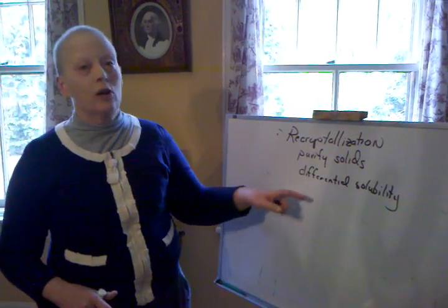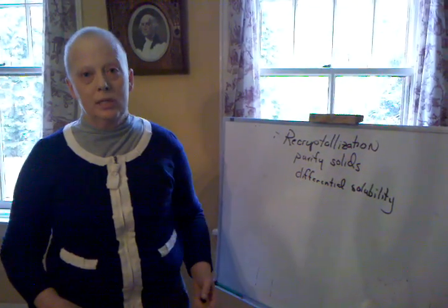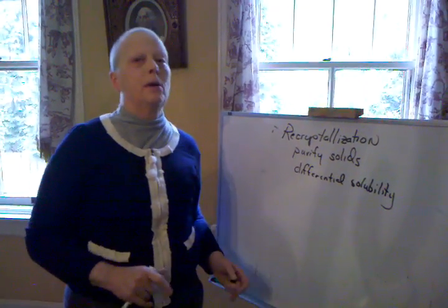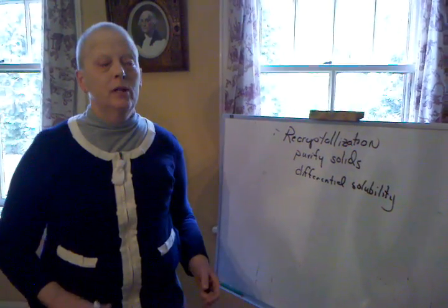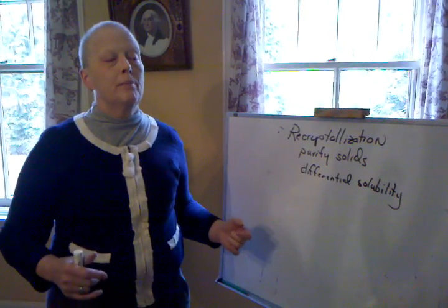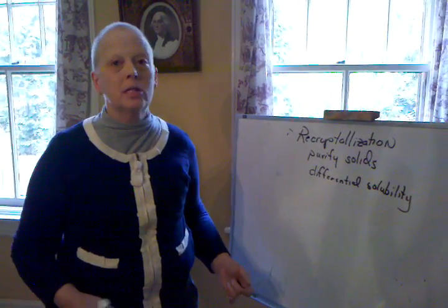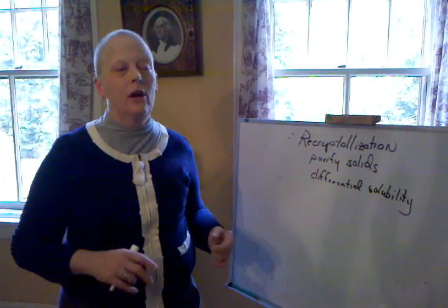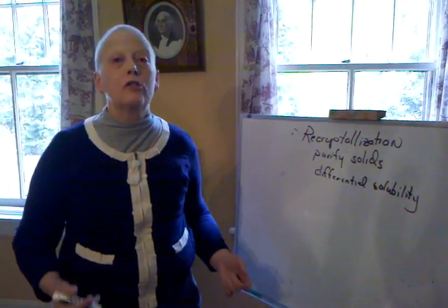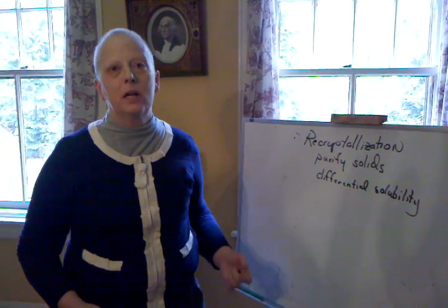In other words, with our crude Diels Alder product, we're going to be able to get more of it into a hot solvent than a cool solvent. So you already know this, and if you think about your common sense knowledge, this recrystallization will make a lot of sense to you. You also know solubility is based on the polarity of the compounds, right? So you already know there are probably some compounds that would not dissolve in your water at all, and then there are other compounds that would be more soluble in water, such as, say, sodium chloride. So solubility is structure dependent. And then the other thing you know is that solubility is based on concentration.